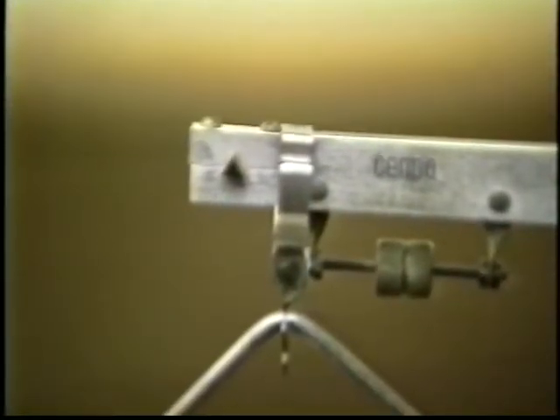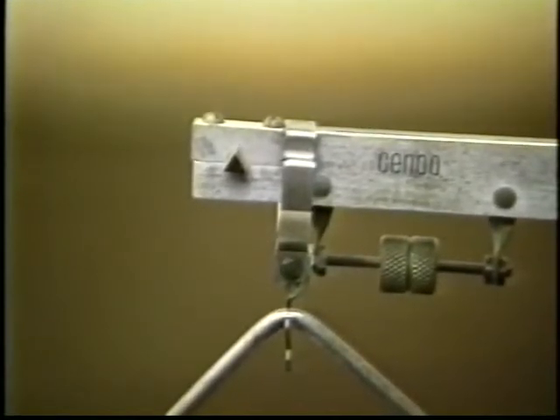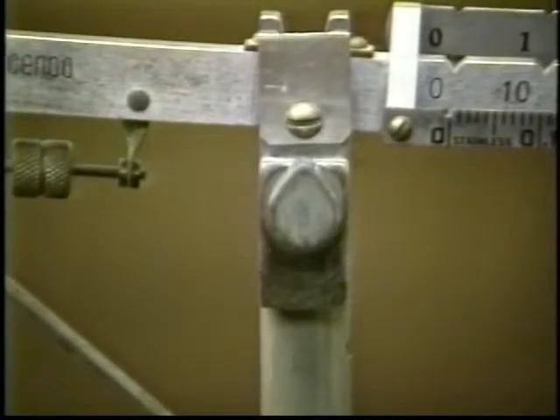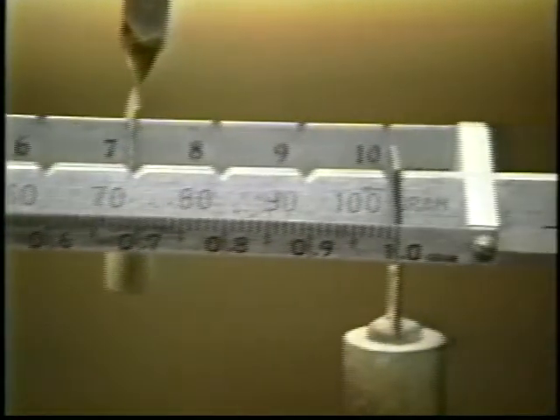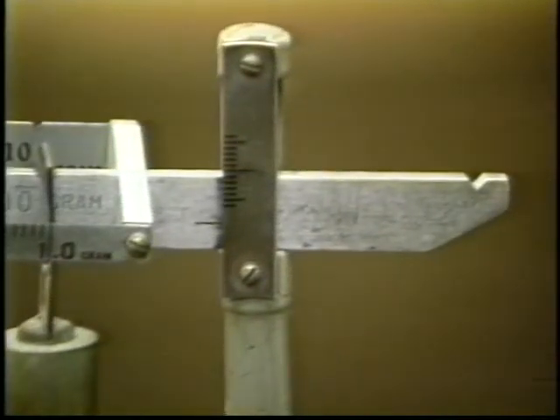Starting at the left end, there is the upper pan support, screws to zero the balance, the pivot lock at the pivot point of the beam, then sliding masses, and a scale to see if the balance is balanced.